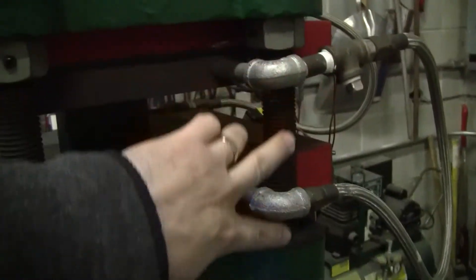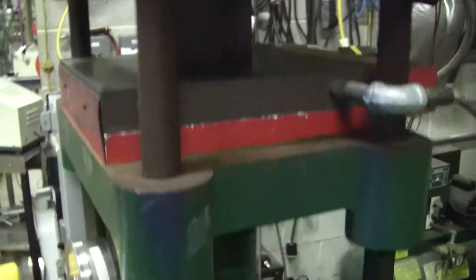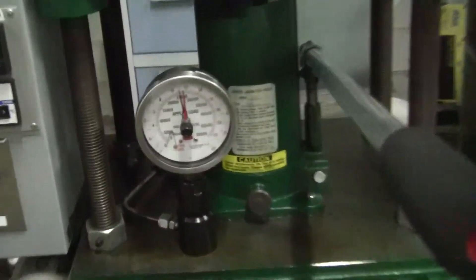Again, the cooling loop on the right-hand side. Four posts. Holding the pressure.